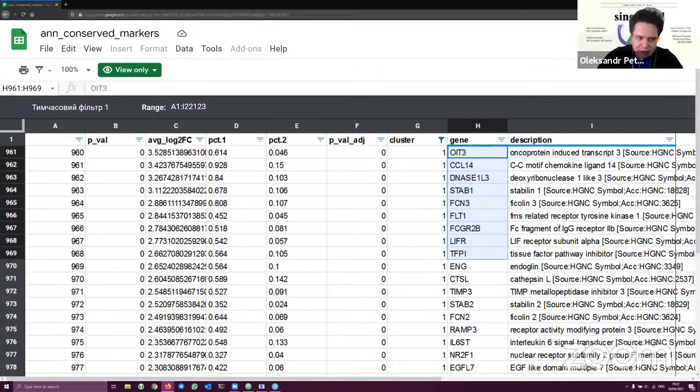So I would like if Carolina would like to make the cluster number 1, Dipanjan cluster number 2, Andrea cluster number 3, Tatiana cluster number 4, Irina cluster number 5, Jonathan cluster number 6, please, Taras 7, Temur Khan 8, Igor 9, Julia 10, Behnam 11, Preeti 12, Pierre 13, and if there's any, yes, of course.